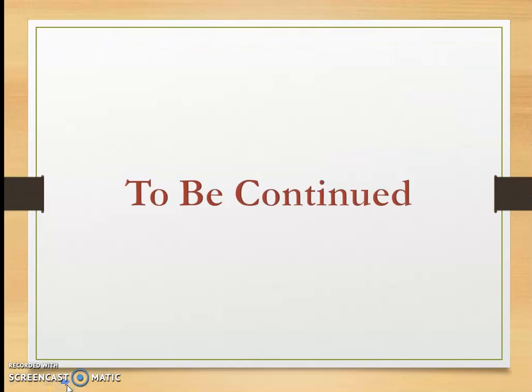Here we studied different types of equipment used for the preparation of emulsion and ointment.